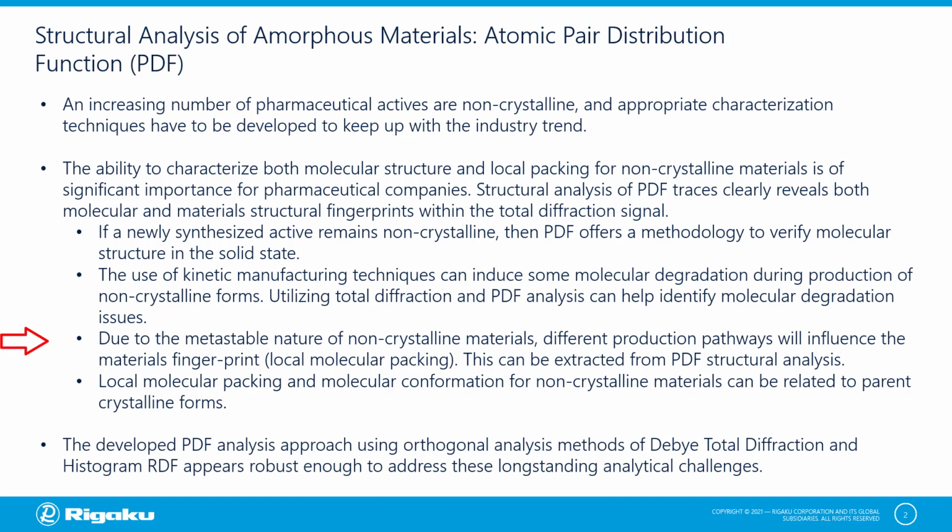Due to the metastable nature of non-crystalline materials, you'll find that different production pathways will influence the local molecular packing, which we call the material's fingerprint. This material's fingerprint can be extracted from PDF analysis and can really help you guide your production process and ensure that you're consistently making the same disordered material each time.